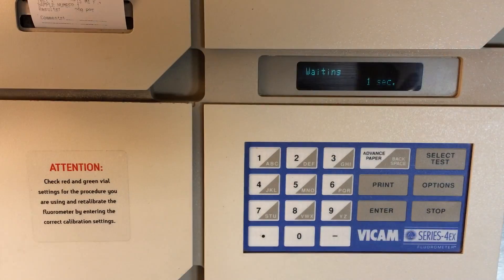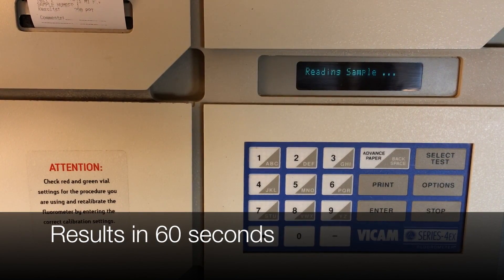The fluorometer produces an answer in 60 seconds and the printer will produce a time-date stamped record of your results.